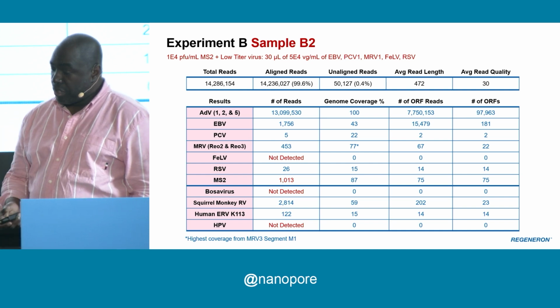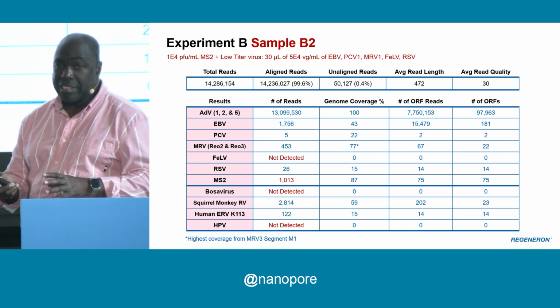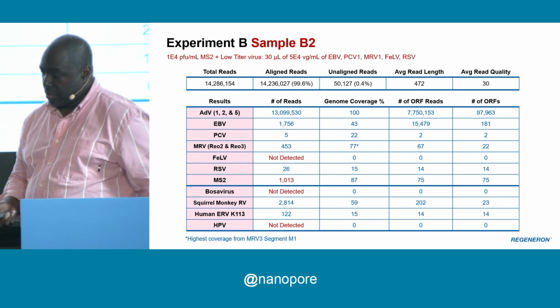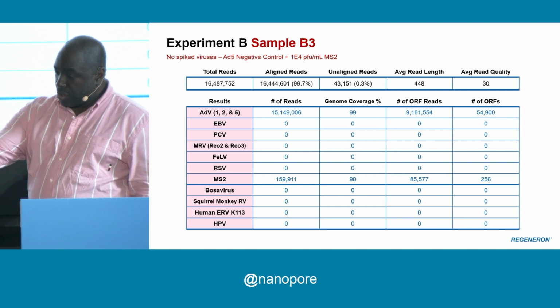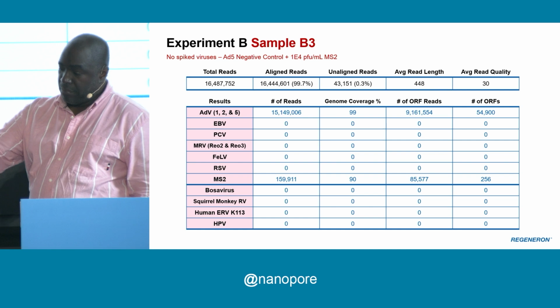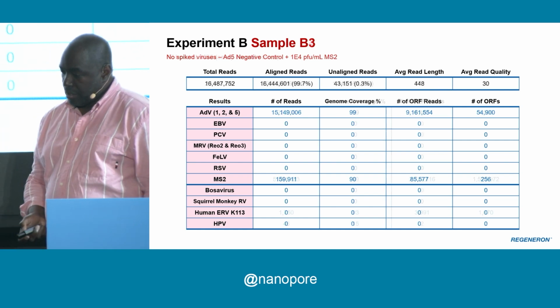So this is showing us that you have some inhibition somehow, but it's not complete to inhibit everything. And you can see here, when we go with just one virus, the adeno, MS2 is showing up at really its full level here.